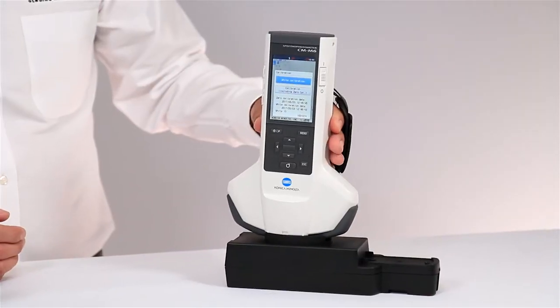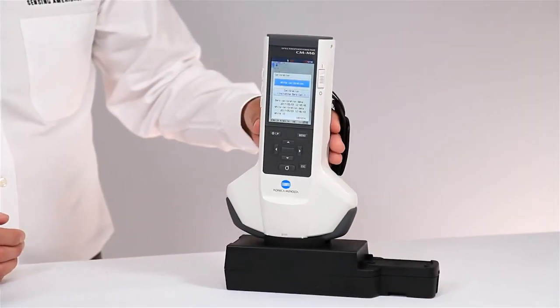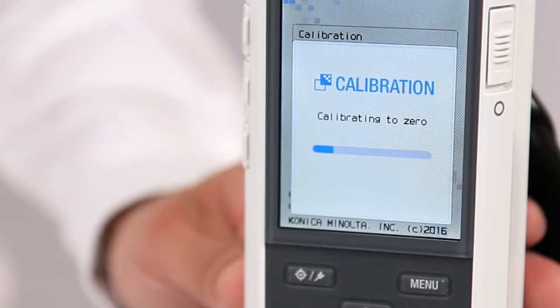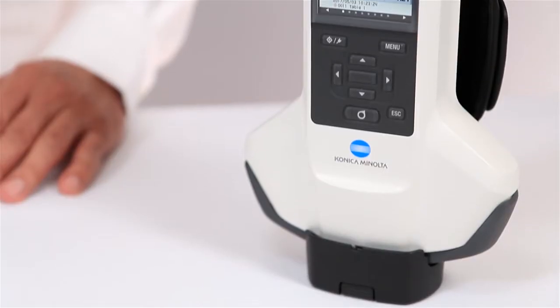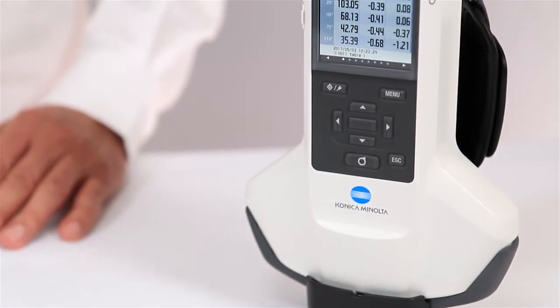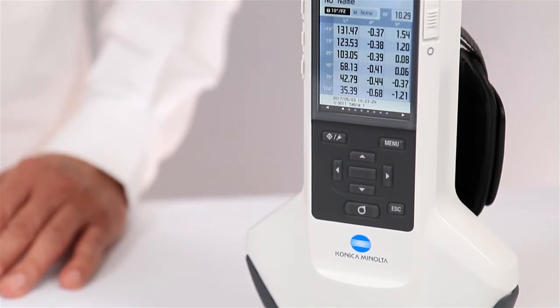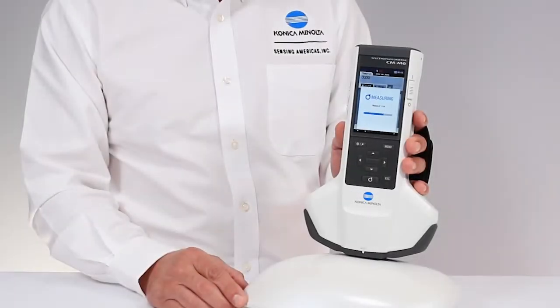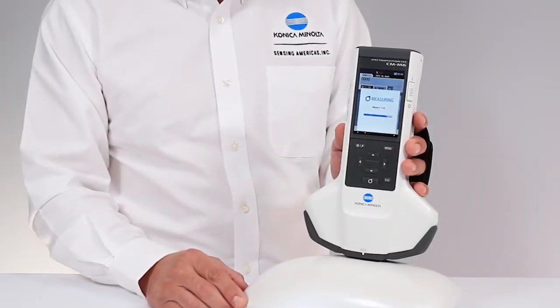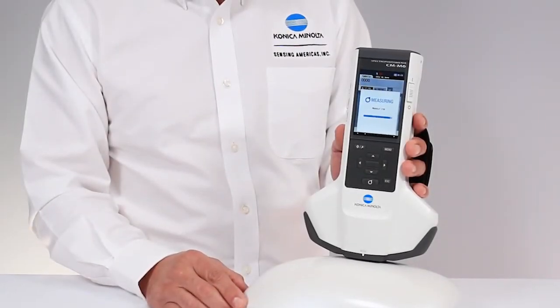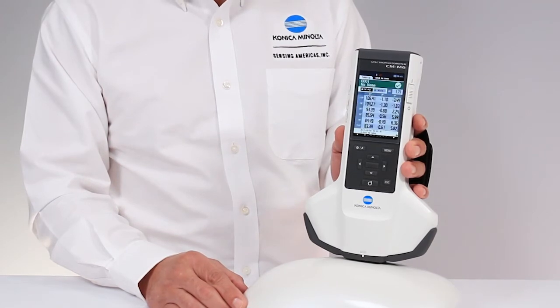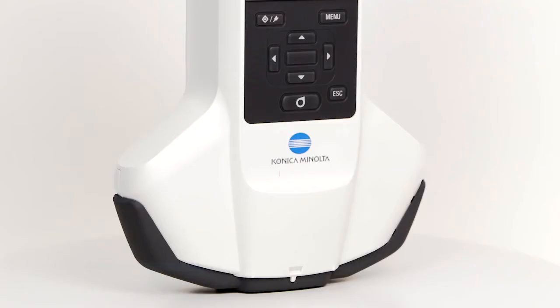You have the ability to choose from different angles or capture all six. Place the instrument against the evaluation area and push the measurement button. It's that easy.